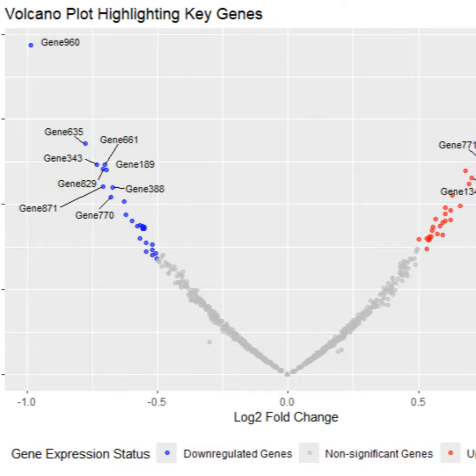It's a fantastic analogy, and volcano plots are right at the heart of this detective work. They help us narrow down the suspects, the genes that are changing the most, and then we can use other tools to build the case to understand what those changes really mean.